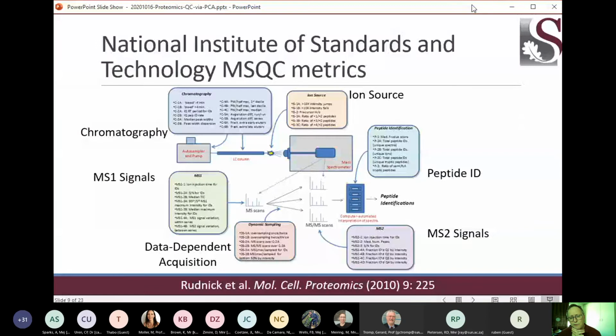So if we have this kind of robustness about the data, and yet the problems associated with a sampling technology, it seems like it would be really valuable if we could characterize if each of these components along the way to a mass spec data file are actually working as they should. So you have an auto sampler and pumps over here. You have a LC column. You have the electrospray ion source, and you have all kinds of things going on in the mass spectrometer.